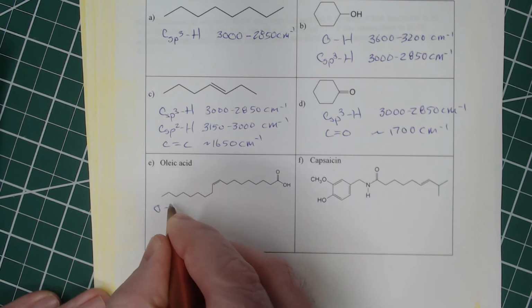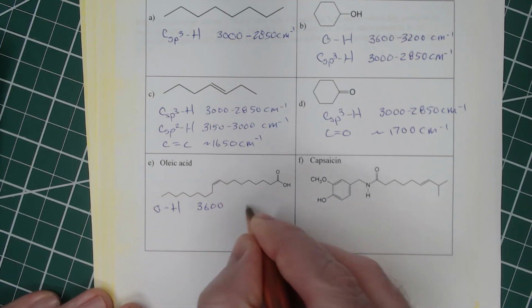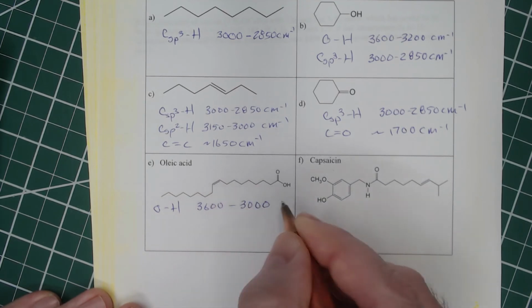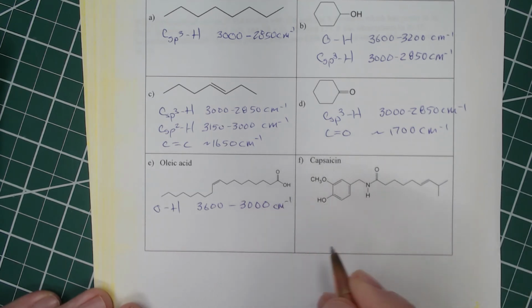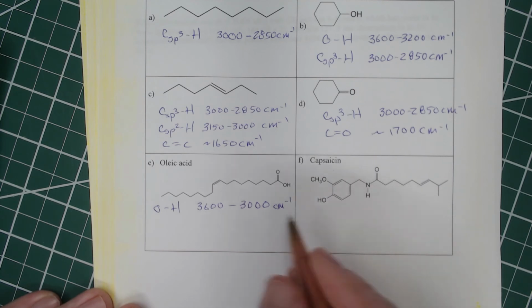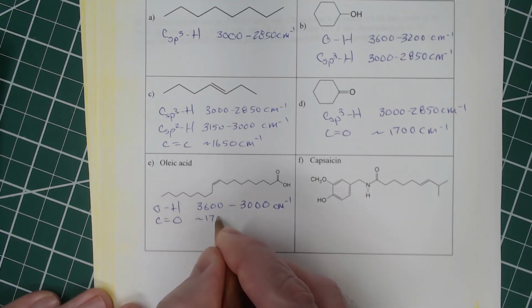So our OH for our carboxylic acid is going to be 3,600 down to 3,000-ish, but it may even go further than that. But it is much broader than the alcohol. We'll have the carbonyl. It's going to be at about 1,700.